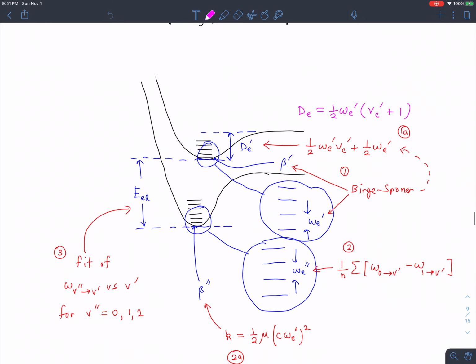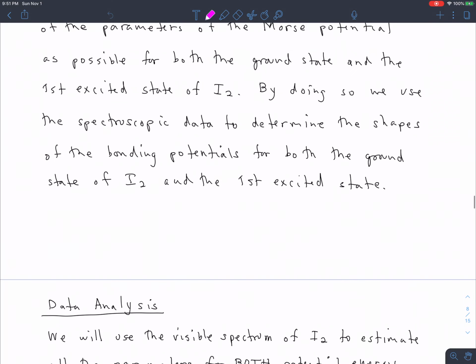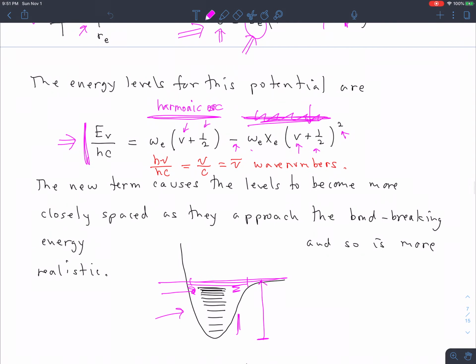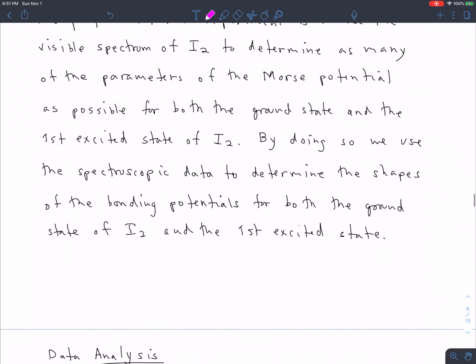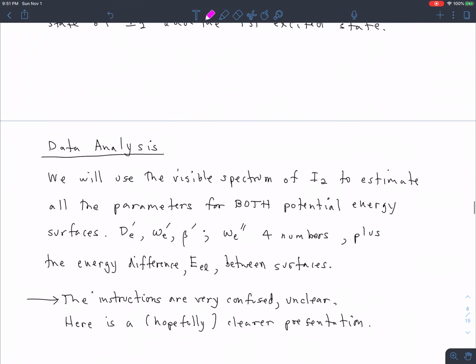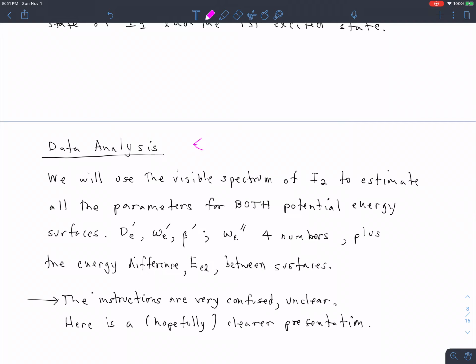And that makes the interpretation of the data a little bit more complicated, but it's also good because it means that we can get out some of these parameters that are connected to the Morse potential itself. And let's see, that is all I want to say for today. Next week we'll talk about the actual nitty-gritty of extracting all those numbers from all those parameters from the data.